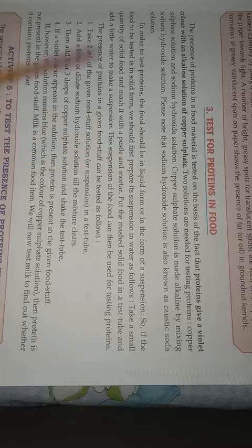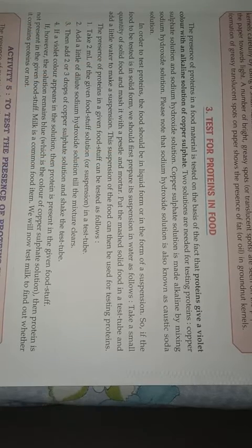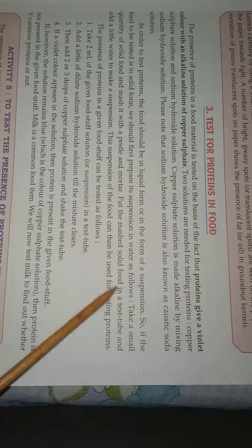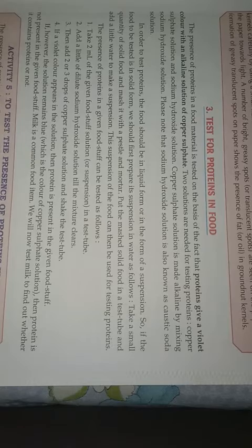If you don't know the meaning of pestle and mortar, it means ukhli. Mash that solid food properly in the pestle and mortar, then put it in a test tube.